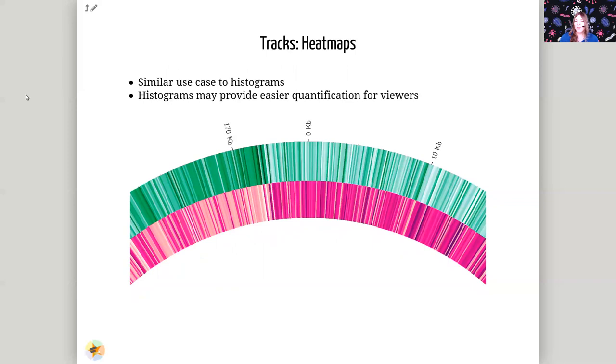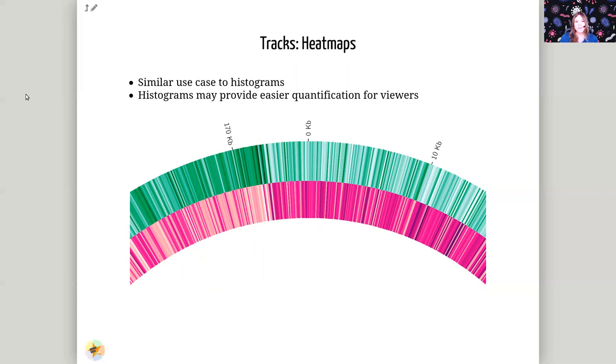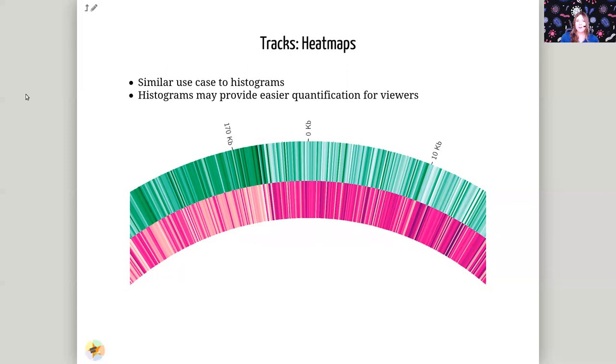Alternatively, you can plot all of the same data sets using the heat map track type, and this will produce a more visually pleasing, but harder to quantify track. So when you need sort of a general feeling of like, are there a lot of genes in this region or something like this, then you can use a heat map where you might not need that more precise like, oh, this is an outlier top 10% value, something like that.